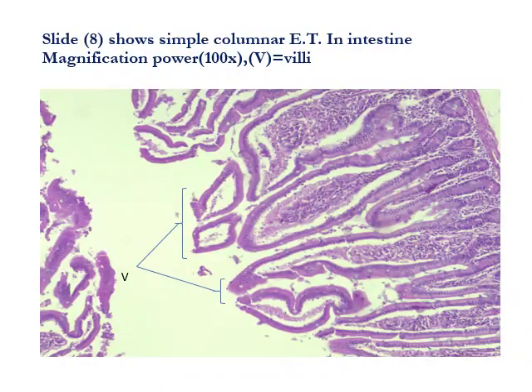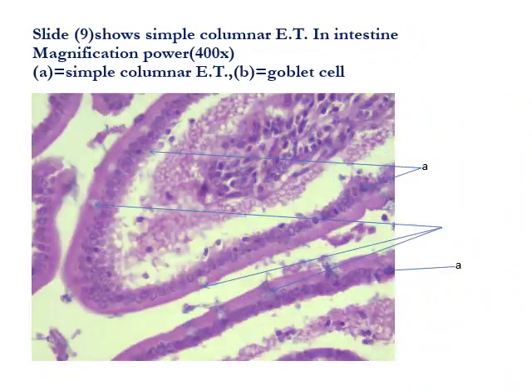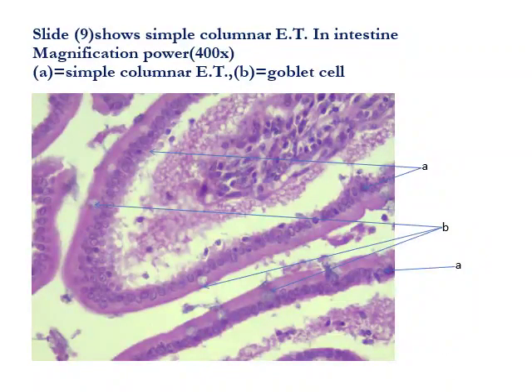This slide shows simple columnar epithelial tissue in the intestine at higher magnification, where A refers to the simple columnar epithelial tissue while B refers to the goblet cell. The villi are visible in the intestine. This type is a simple non-ciliated columnar epithelial tissue.